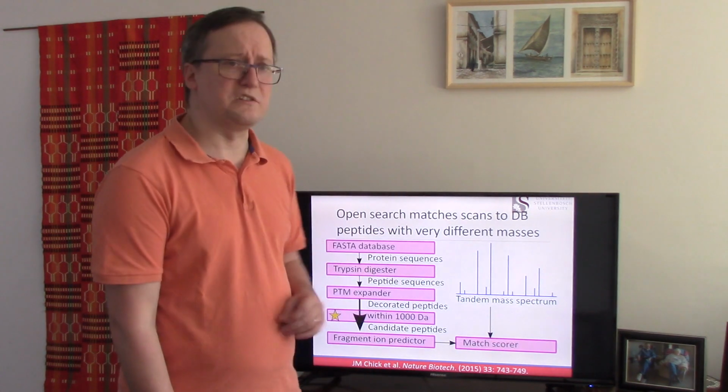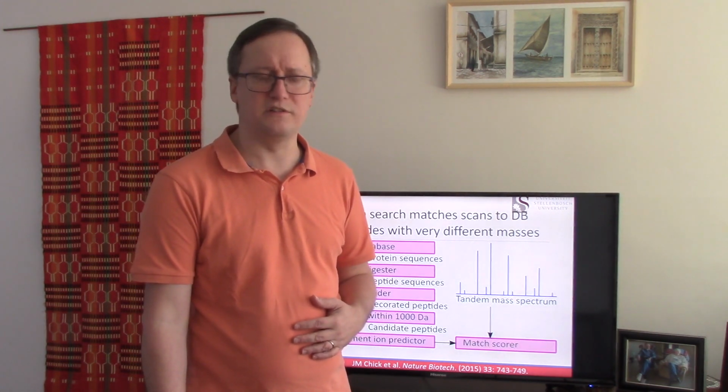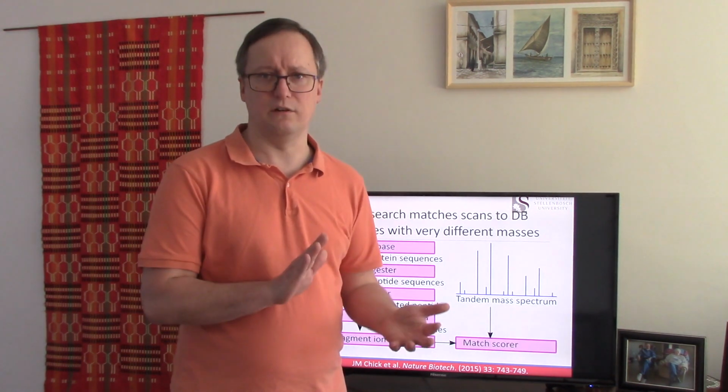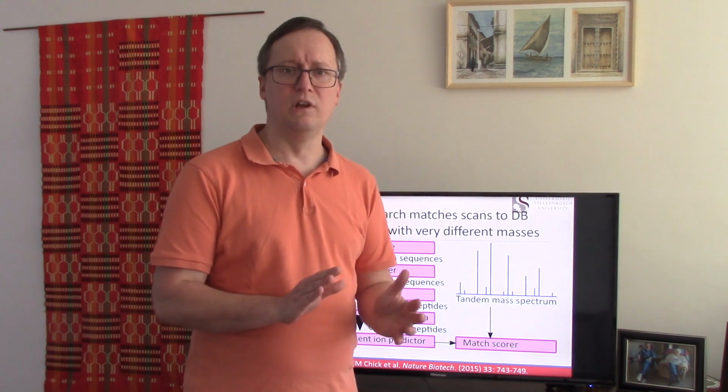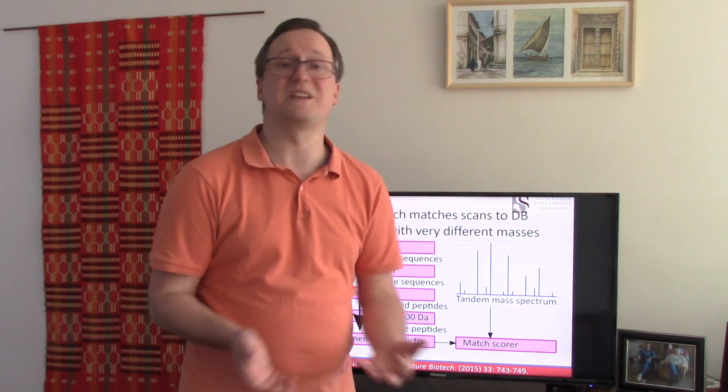So, OpenSearch represented an effort by Chick et al. from the Steve Gygi lab on how to modify database search to make it more amenable to the recognition of modifications that aren't specified in advance.